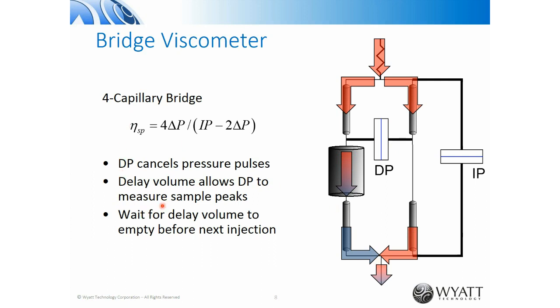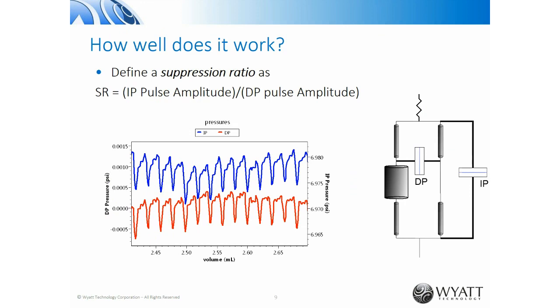There is a downside, namely you do have to wait for the sample to go all the way out of the delay volume before you can make another injection, because this thing has to be pre-filled with solvent. Okay, so let's talk about how well it works.